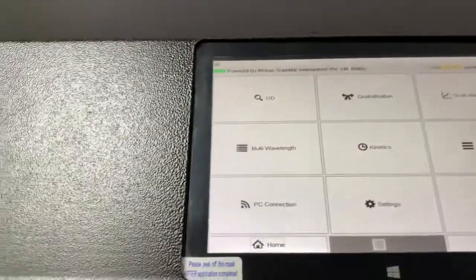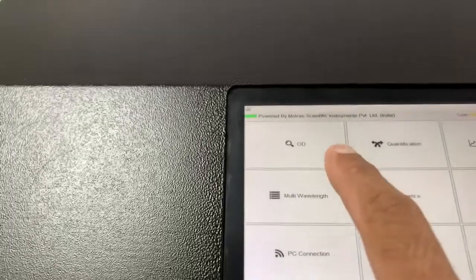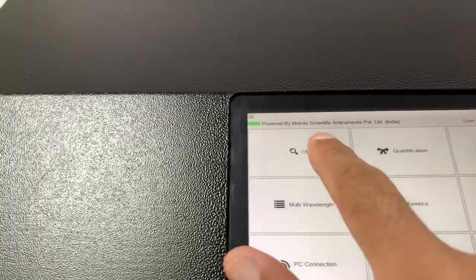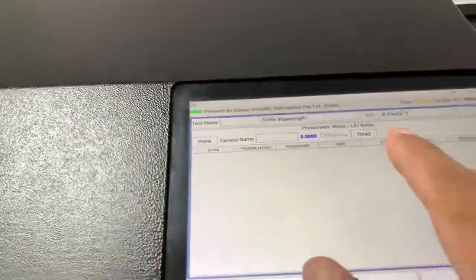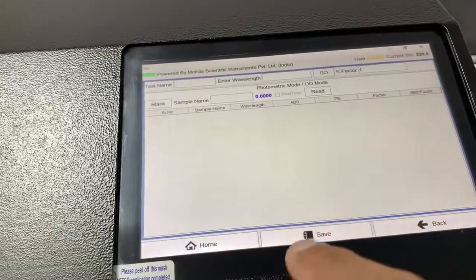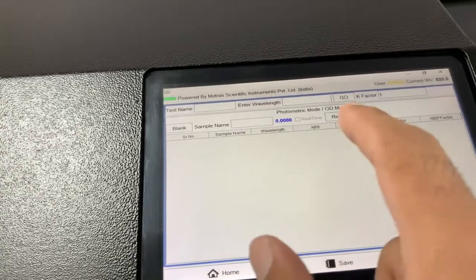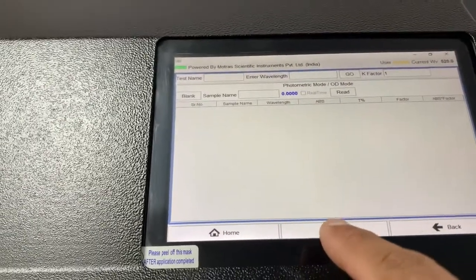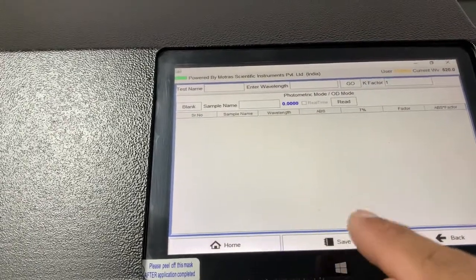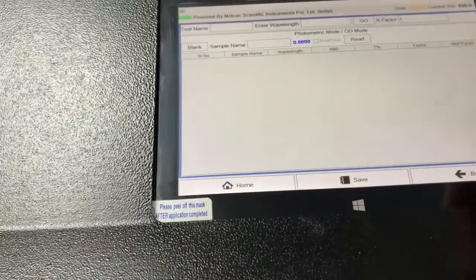This is the layout. From here, one can do OD photometric mode. You can take the results and save them to a pen drive or print them.